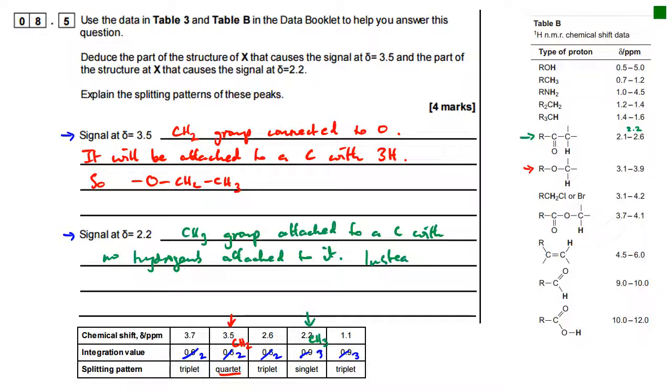Instead, it is attached to the C double bond of a carbonyl group. Okay, so let's just draw it out. There's our carbonyl group. There's our CH3 group.